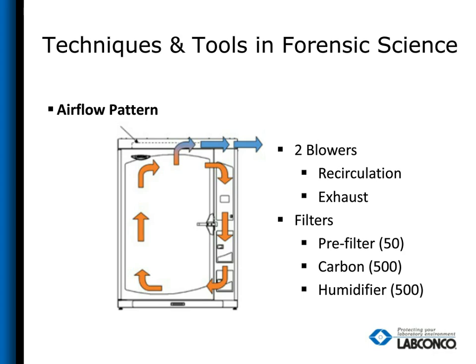What happens is the technician or the examiner will be using an automated system. They'll put their glue in, they'll put their evidence in, they'll start the process, and they'll get taken away for other duties and tasks. They know the system will stop, exhaust all the CA fumes, and then turn itself off, and they can return at a later time. What they don't realize a lot of times is that the heat plate does not cool back to room temperature.